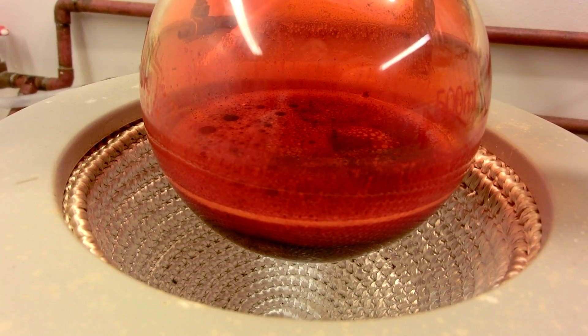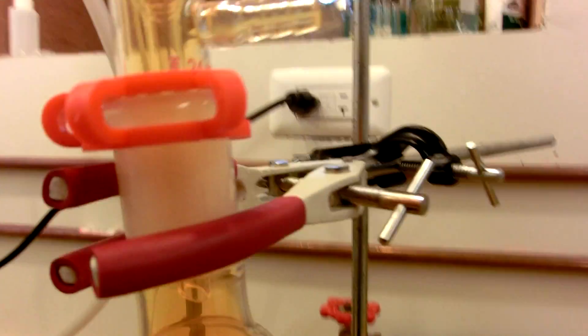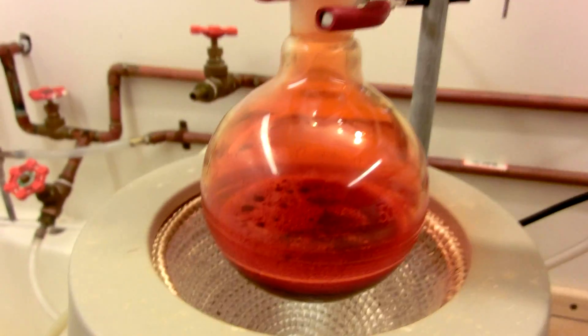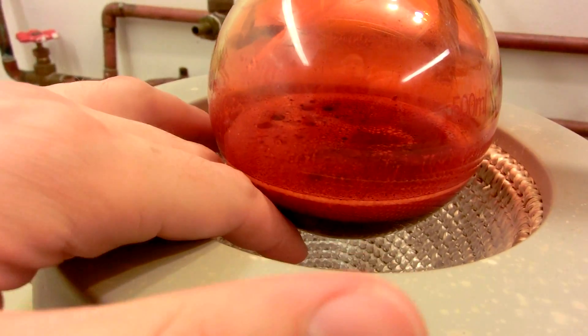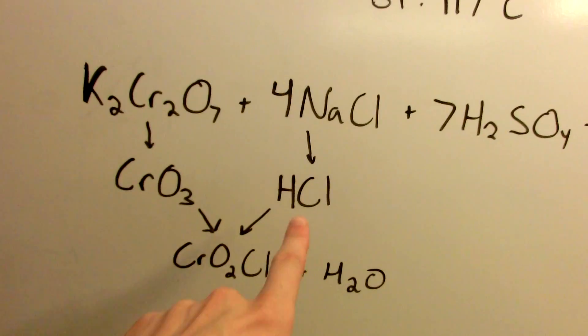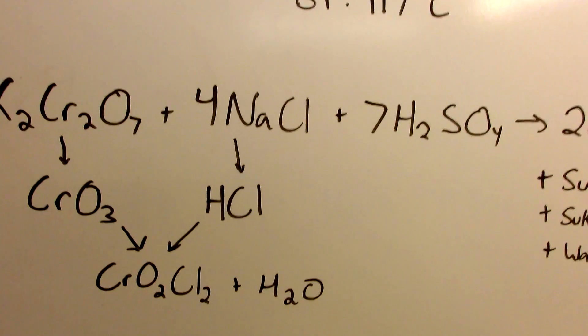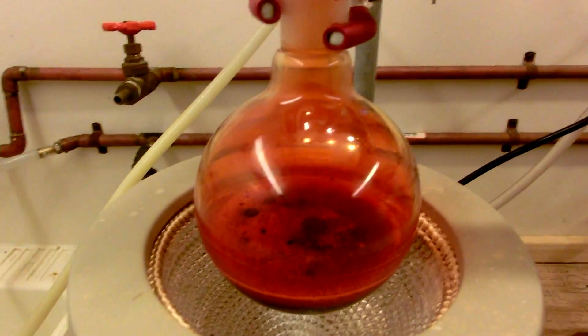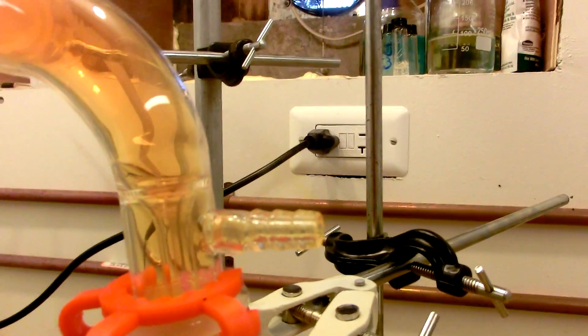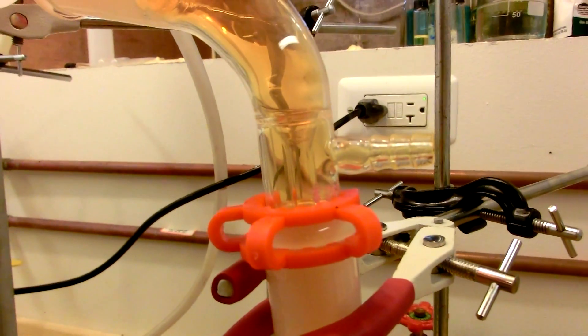You'll notice, as you're waiting for these reactants to reach equilibrium, that a brown gas will begin to fill the apparatus, and this gas will fume fairly heavily in air. You can see it here coming out of this vacuum port. This gas contains some chromal chloride, because this is warm enough to boil off some chromal chloride - I can feel it through the flask, it's actually quite hot. However, this gas is mostly hydrogen chloride from the original reaction escaping because of a not very thorough mix between the potassium dichromate and sodium chloride. The hydrogen chloride gas is moving up through the apparatus and taking some chromal chloride with it, and then fuming when it hits the air and reacts with moisture in the air, forming hydrochloric acid. Make sure you don't breathe this, because it contains hexavalent chromium and hydrochloric acid.